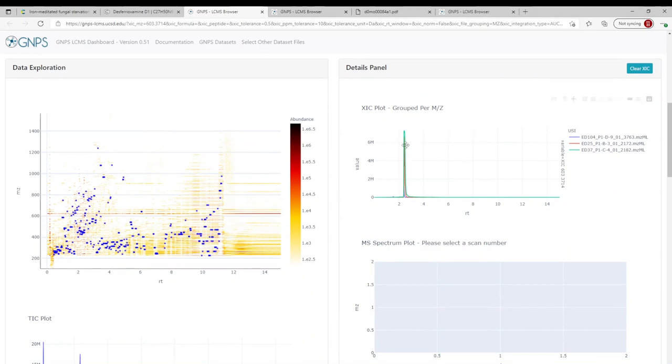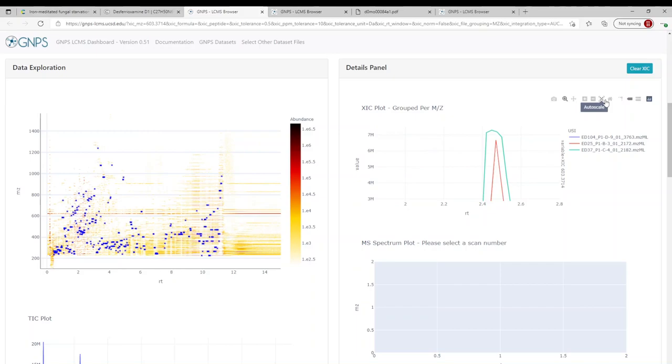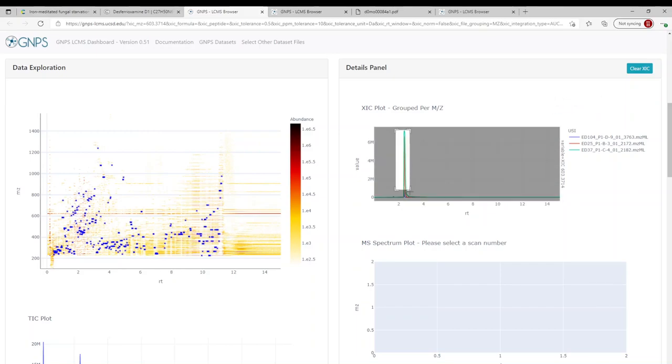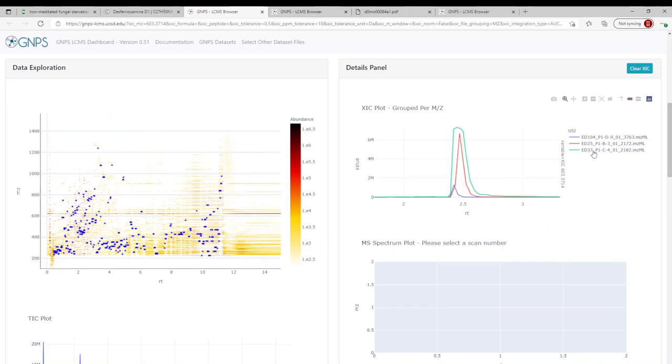And if we zoom in on this peak, we hopefully should see the three things we want. So here on the right, you can see represented are three samples from this study. So ED104 represents a streptomyces monoculture. ED25 represents co-culture with Aspergillus niger. And ED37 represents co-culture with Botrytis cinerea. All three are common, all two are common plant phytopathogens.